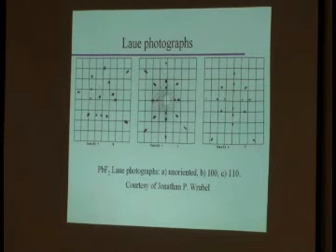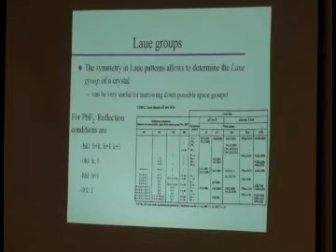PbF2 is cubic. Okay? And now we go back to that table of systematic absences that I sent you, and to the things that we skipped when we first talked about space groups. In that table of systematic absences, you have something that is called Laue class. Okay? And what it will give you for cubic is two different Laue classes, m3bar and m3bar m.